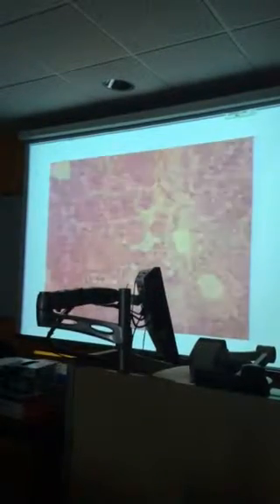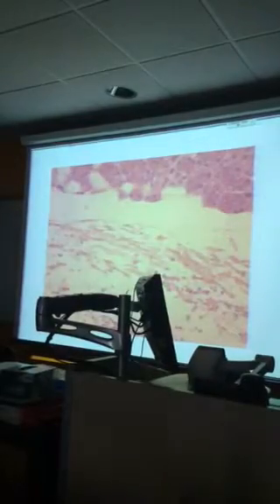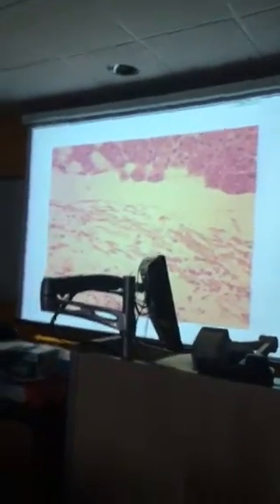Anyway. Okay, any other questions on this? This is fat here, okay? What's the stuff on the very bottom? All that stuff? Connective tissue.